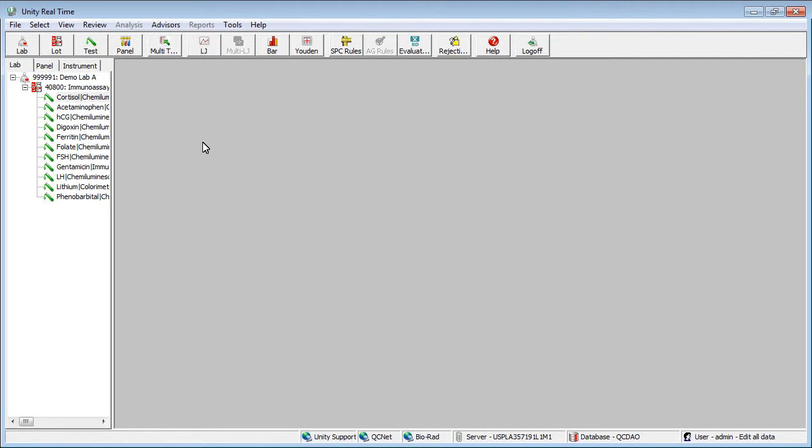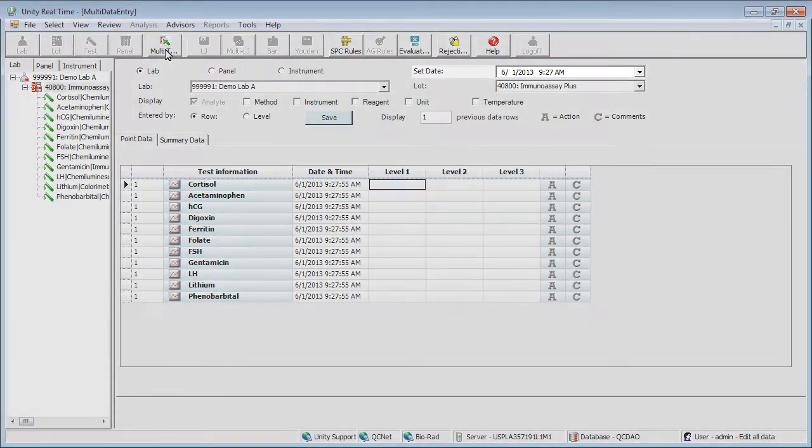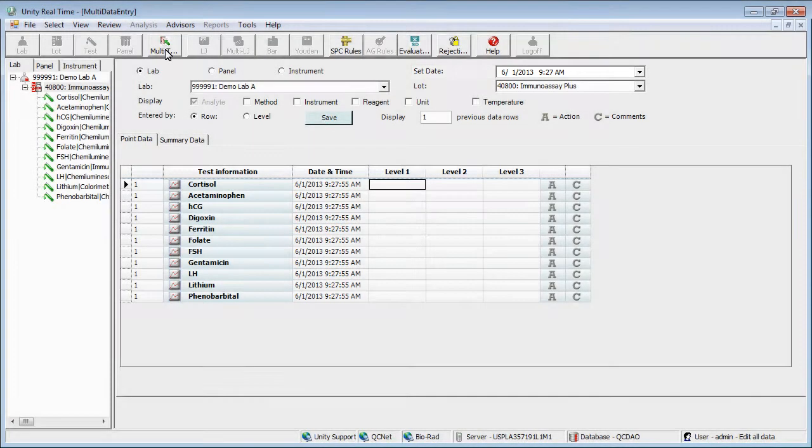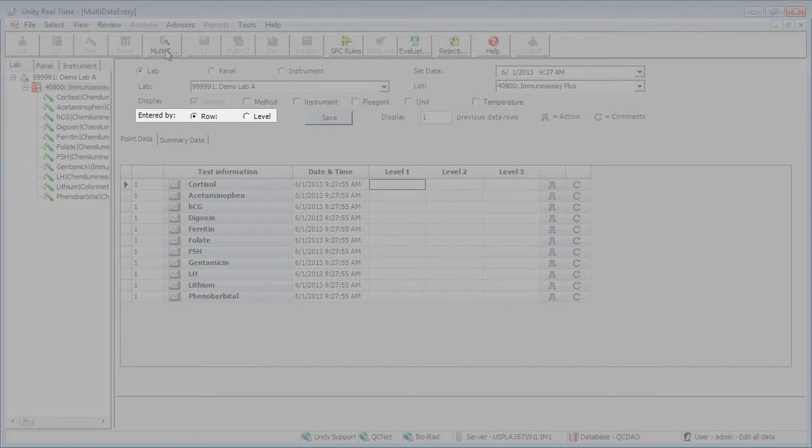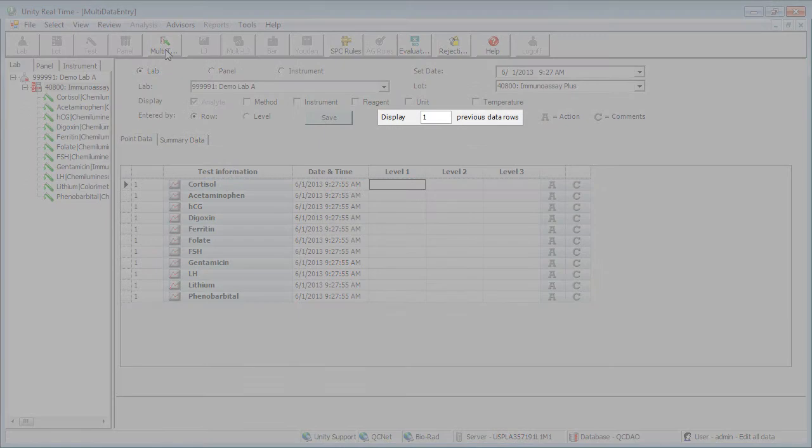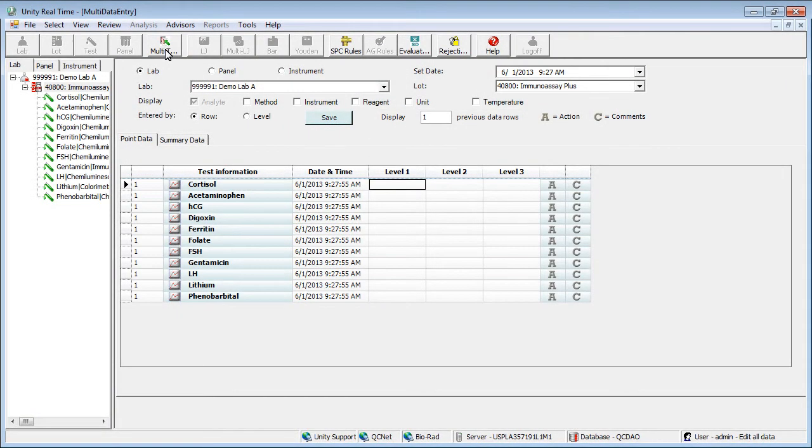Select a lab and lot. Click the Multi-Test Data Entry button. Set Date allows you to set the date for all tests. You can enter data by row or level, and determine how many rows you want to see prior to the current row.